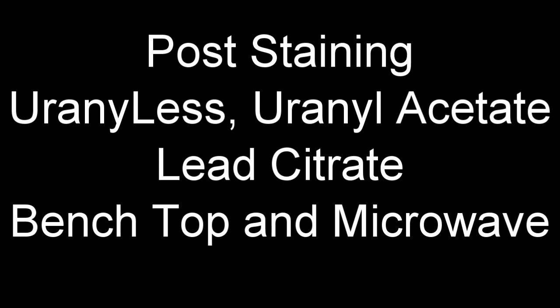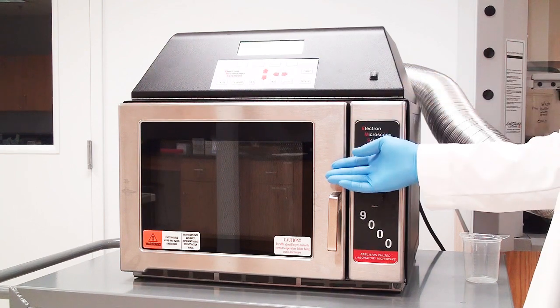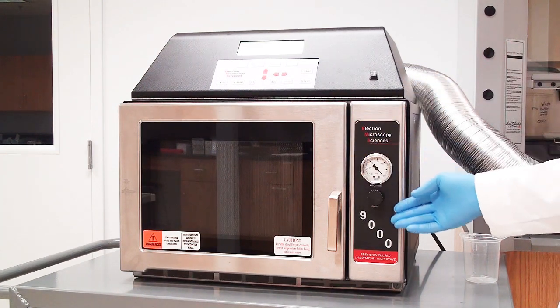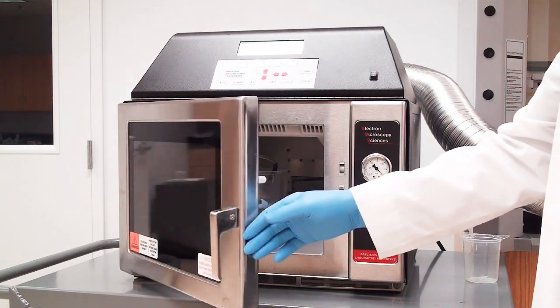In this post-staining video, we're going to compare uranyl less with uranyl acetate and also benchtop staining versus microwave staining. The microwave we'll be using is the EMS 9000, and if you use this for regular processing, it's going to function exactly the same.